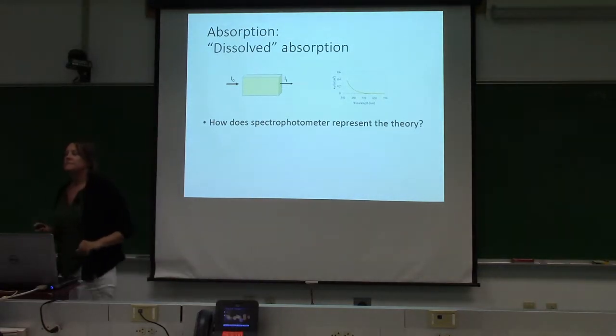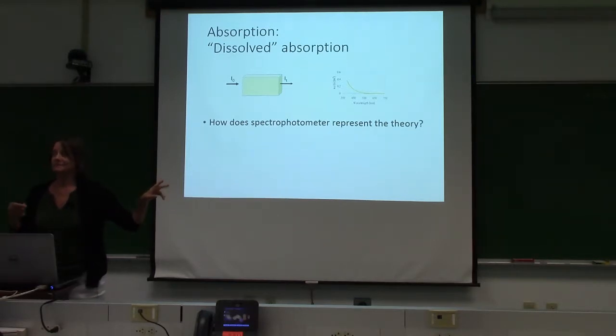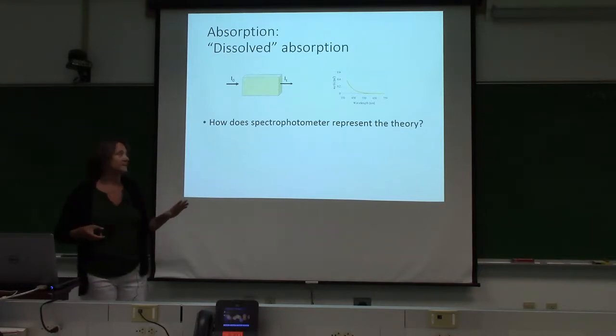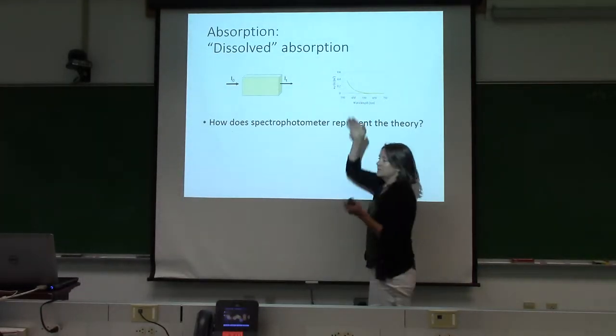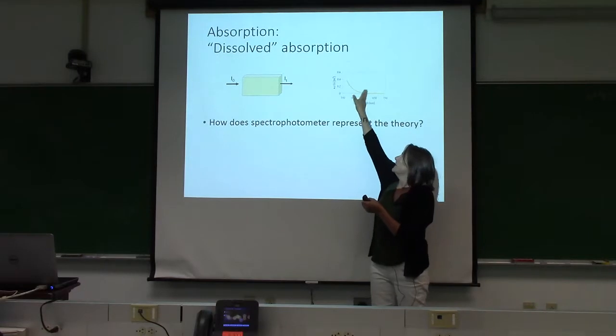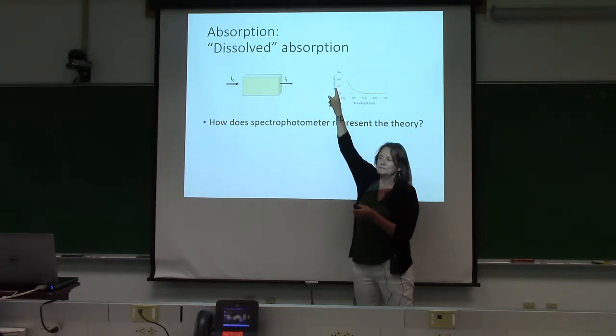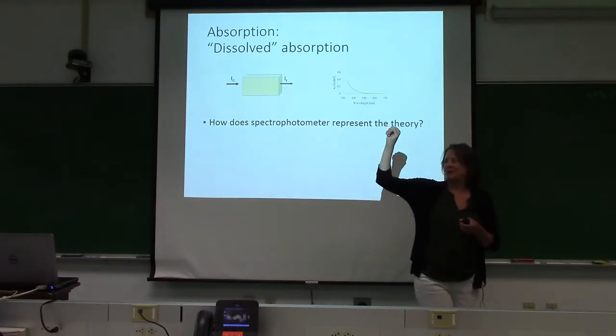So you are at the point where you're limiting, where the amount of light is just not making it through the sample. Right, just like flattening of the absorption peak for phytoplankton, you can get flattening of the CDOM. And what's interesting, and you will see a lot of examples of this in the literature, if the CDOM concentration is too high, instead of getting a nice exponential like this, you'll get a flatter exponential. And what does that mean about your slope? The slope will be lower.